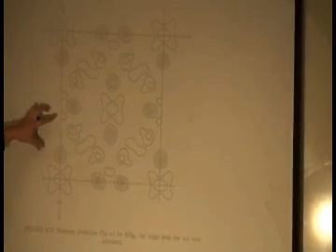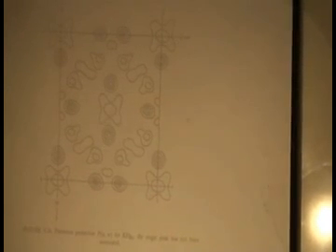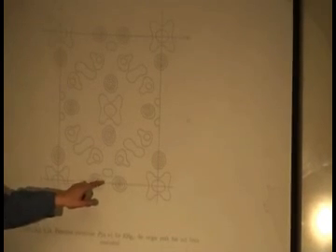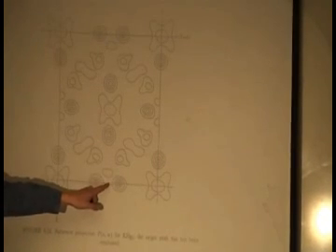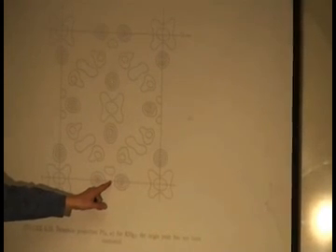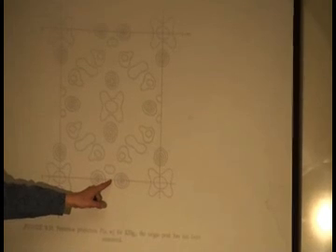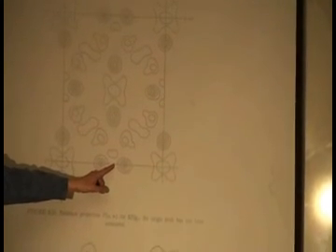So you're looking down the v-axis, you see everything in that cell. If there was a peak at 1/2, 0, 0, there should be a peak at 1/2, 0, 0. Is there a peak here? So that's not a good position, is it? Because just looking at A, we really don't find that atom, do we?